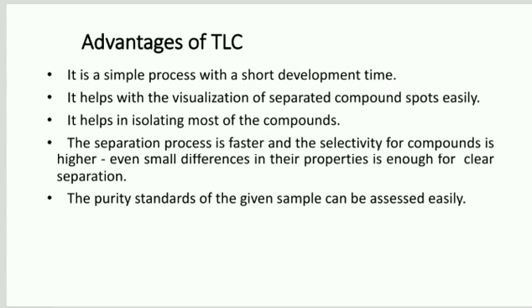Advantages of TLC. It is a simple process with a short development time. It helps with the visualization of separated compound spots easily. It helps in isolating most of the compounds. The separation process is faster and the selectivity for the compounds is higher. Even a small difference in their properties is enough for clear separation. The purity standards of a given sample can be assessed easily.